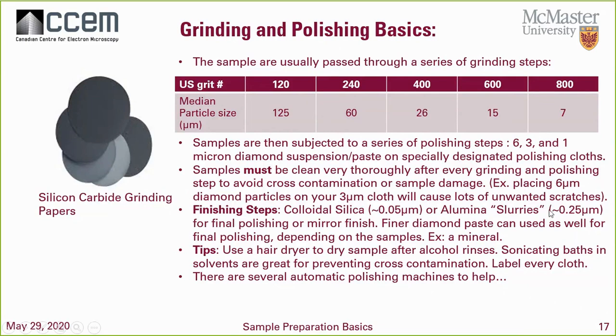So usually about 300 milliliters of colloidal silica for about 5 minutes after 1 micron should give you a nice mirror finish, right? But obviously some samples are sample dependent. Sometimes if you want to highlight some aspects of your sample, you might want to add an etch into your colloidal silica or your slurry, just so that you can see some extra features in the light microscope when you go and check it, okay?